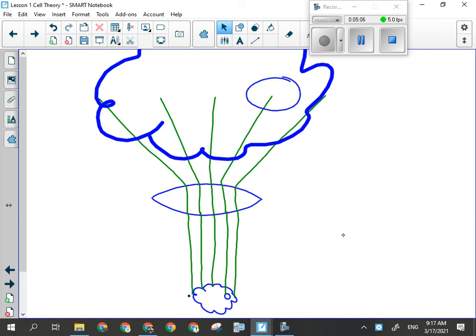So I've got this thing flipped now, but now it's bigger. What the lens has done is make it look a lot bigger because it's diverged the light. It's spread out that same amount of light that went through this tiny microscopic specimen and made it take up more space like this. Kind of follow? A microscope works by bending the path of the light that comes through the lenses in such a way that it makes objects bigger. A telescope works the same way. It's going to take light that comes from a distant object.